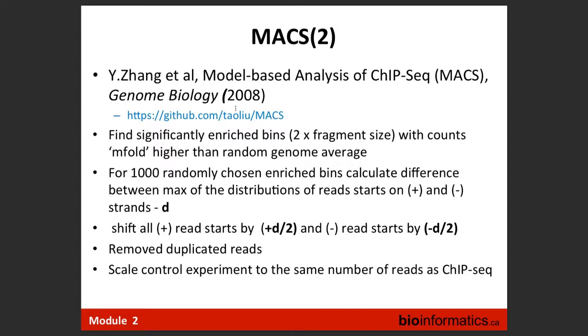The problem comes when the data is more complicated. MACS explicitly assumes a Poisson model for the background, and here we just have luck that it works, because the background is not Poisson at all for ChIP-seq. It may be Poisson in the ideal world, but with the many, many biases which I mentioned, which are not stochastic, they are always shifts, right? They're not of statistical properties. There's something which just repeats itself. It gives us some kind of shifts in some of the variables.